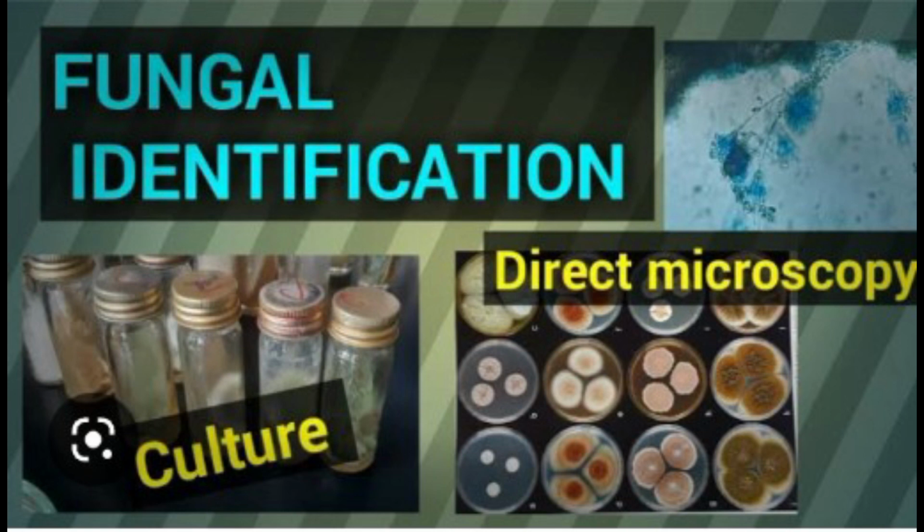Slide culture. Slide culture is a useful technique to study the undisturbed morphology of fungi. Requirement: mold to be tested. The slide culture set: sterile petri dish, filter paper, V-shaped glass rod, glass slide, glass cover slip. A sterile glass test tube with rimless mouth and inside diameter of 15 millimeters. Sterile distilled water. Sabouraud dextrose agar in a petri dish to a depth of 2 millimeters.